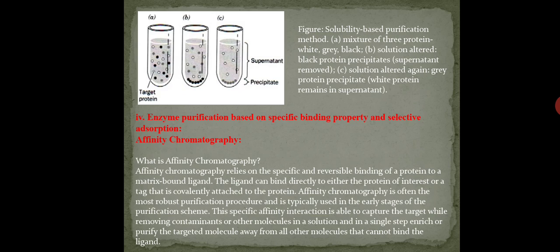Okay, now suppose we add the salt from upside. In that tube there is water and protein. Okay, proteins are made of amino acids. There are two types: hydrophilic and hydrophobic. Now hydrophilic, as they are water loving, are present outside the protein structure, and hydrophobic are present inside the protein structure, so they cannot interact with the water. Okay, now what additional thing have we done? We have added the salt.